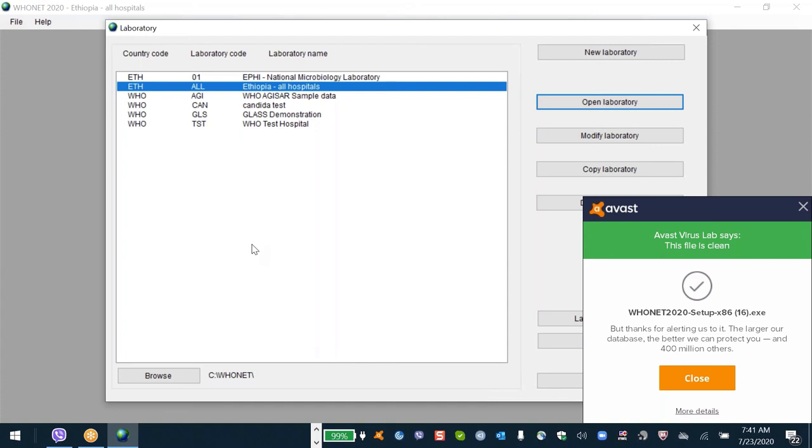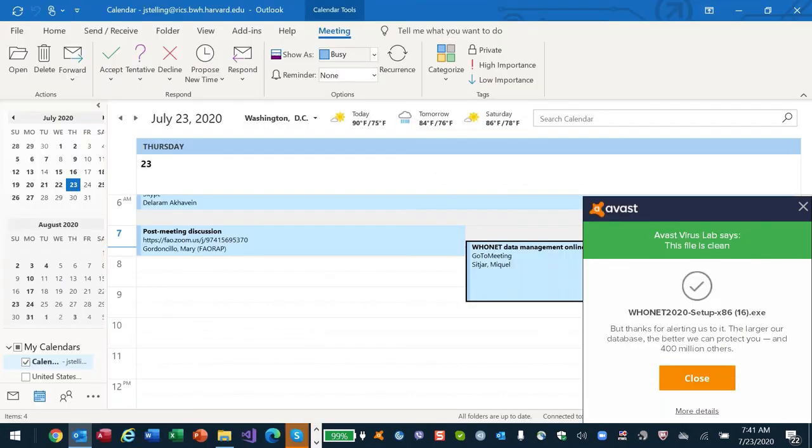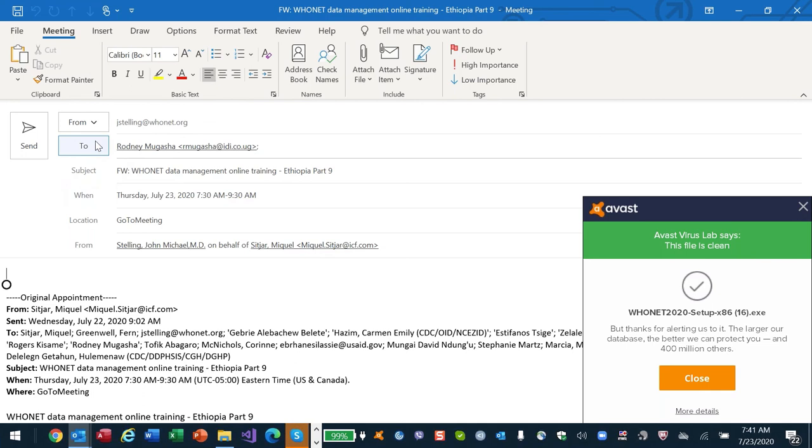Yeah, maybe I have one question. Yes. It's really good to have a national configuration because while you are analyzing hospital one, you are expected to open its own laboratory. So you can analyze the whole data by using this national configuration. My question for you is, the national configuration will contain all the possible fields that are found in all hospitals, but sometimes the variable names or the field names might be different, but they have the same information. So in that case, the national configuration will treat these variables in a different field, right? So how can you manage these things?